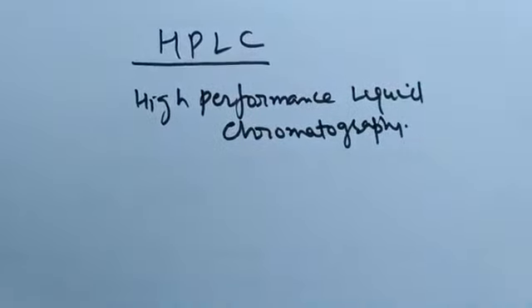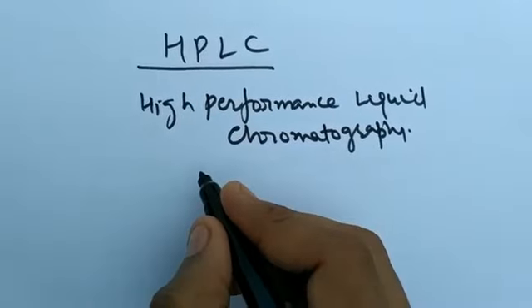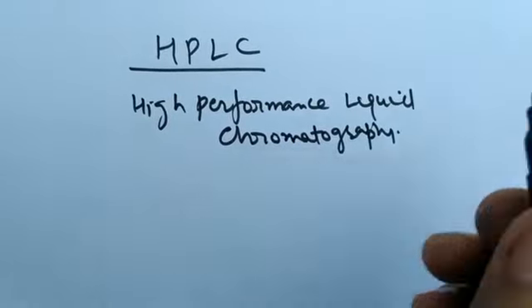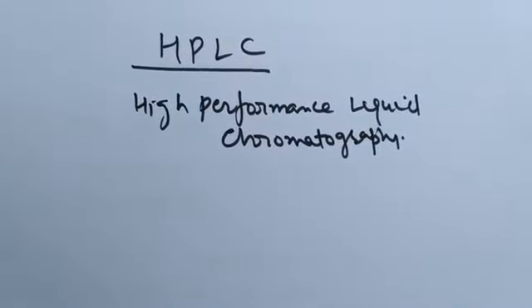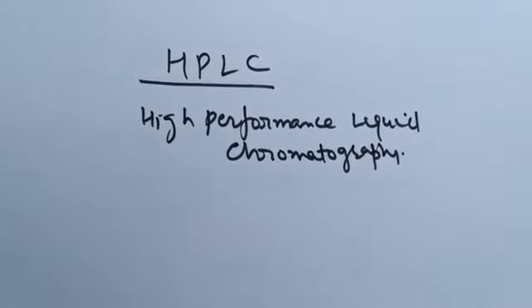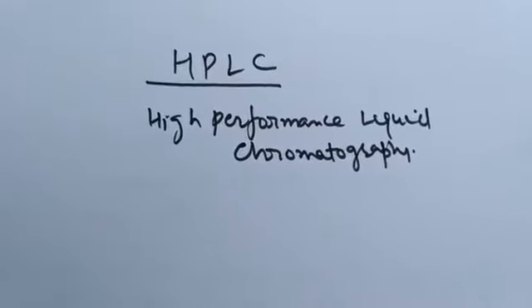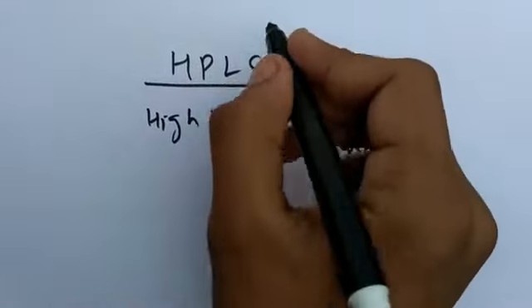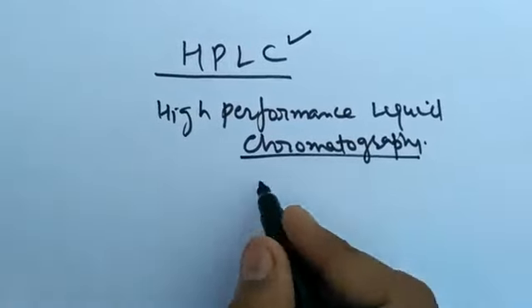So this lecture is about the instrumentation and methodology. Various methodological techniques are used in science for the separation of various types of biomolecules, and also for detecting their nature, particle size and molecular weight. HPLC is one of these techniques. It is a chromatographic analysis.